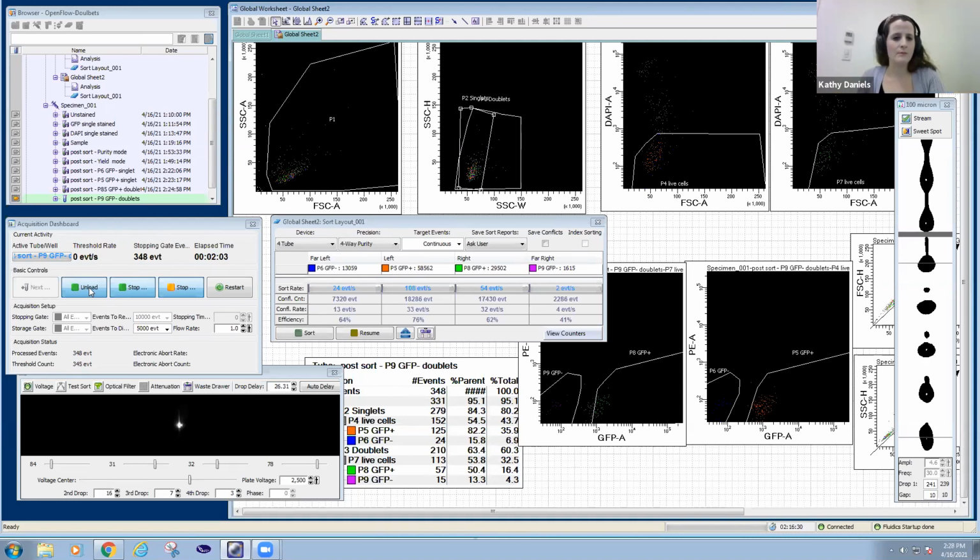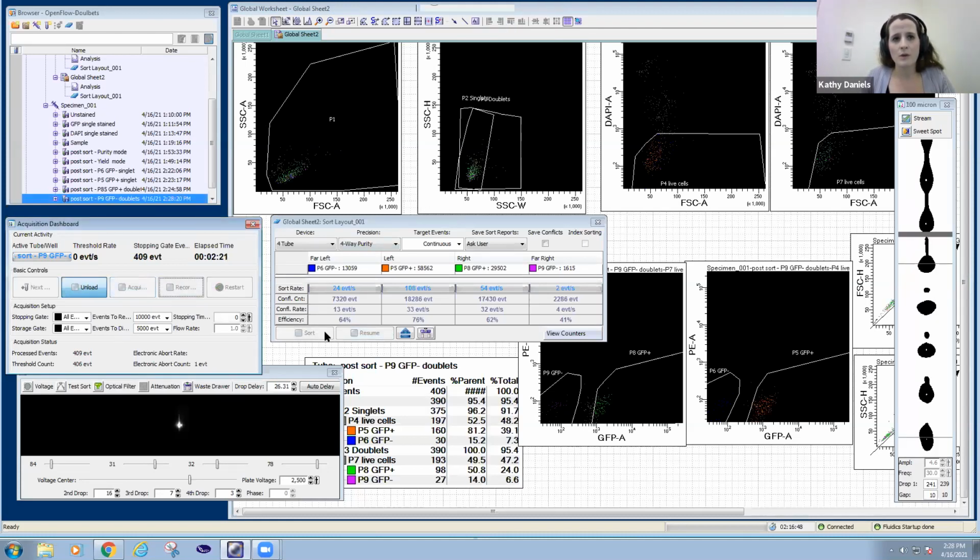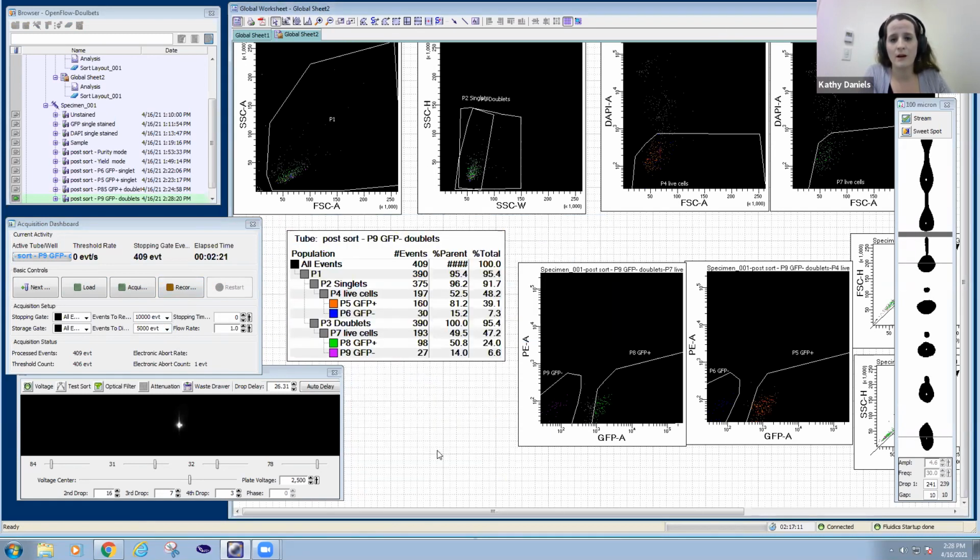Yeah, absolutely. And there is a question about how you can pre-coat those tubes. You can either fill them with whole serum, or you could do PBS with 20% FBS, or 5% BSA. You can leave them at room temp for at least 2 hours, or leave them overnight in the fridge. Then you can remove the excess serum or buffer beforehand, so that you're just sorting into straight serum if you used whole serum, which some people like, or you can have the collection media put in there if you remove the buffer that you used to coat the tubes with.